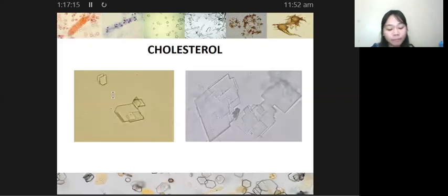Okay? So we have here, nakita naman ninyo, yan. So, ano ang kanyang appearance? Rectangular plates with notches. Diba? Ayan, may mga notch po siya. And then, staircase pattern kasi nga, parang ganyan. Ayan, ito, parang staircase pattern po siya or broken window pane. So, para siyang basag na glass. 'Di ba? Glass windows. Alright, so that is your cholesterol.